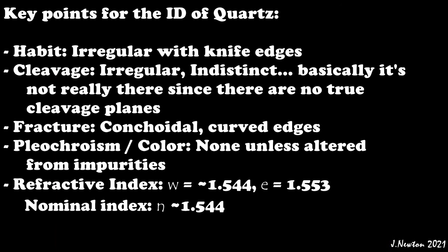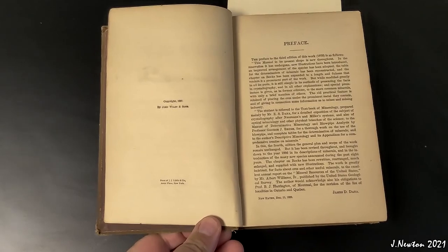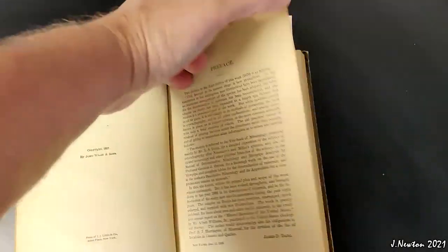In ending, I'll leave you with a few key points on what to look for when you're trying to identify quartz. All of this information and more can be found online or in any number of the textbooks that have been written since the 1800s.